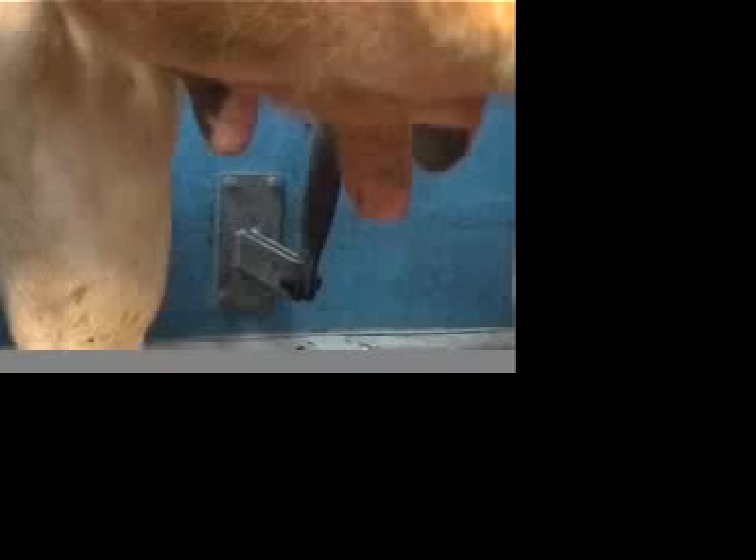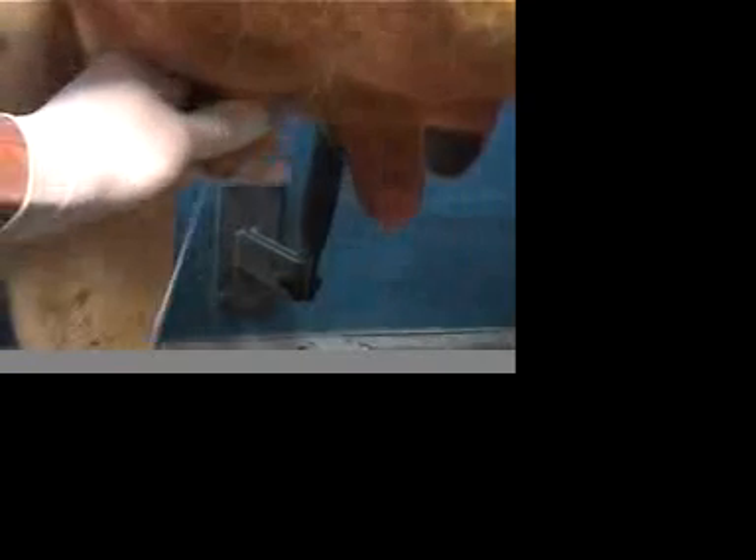If the cow's teats are very dirty, wash in warm water and thoroughly dry. This cow's teats are fairly clean. So first, wearing new disposable gloves, strip a few squirts onto the floor. This is to flush out any bacteria lurking in the teat end.